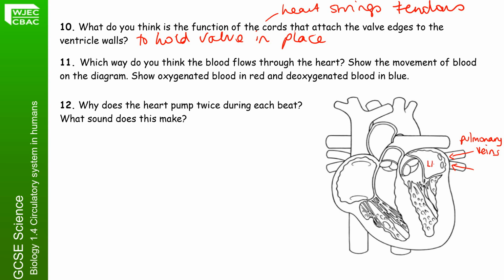Here's our left atrium. Here's our bicuspid valve. Here's our left ventricle. Here are our tendons, our heartstrings. And here are our semilunar valves.